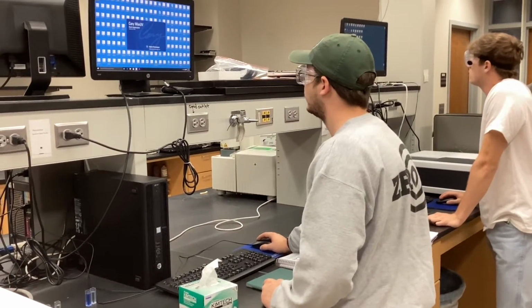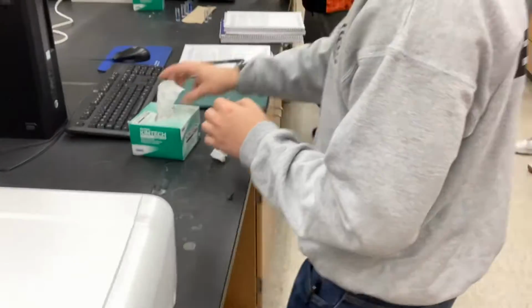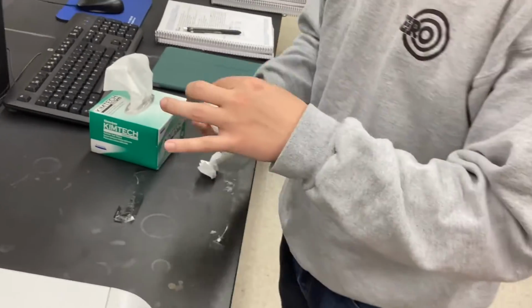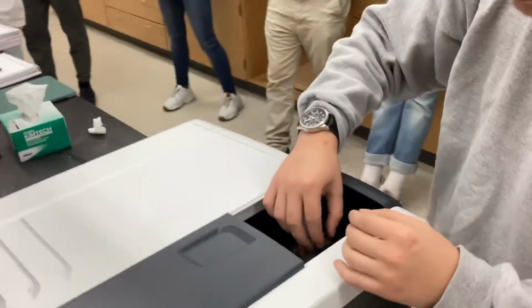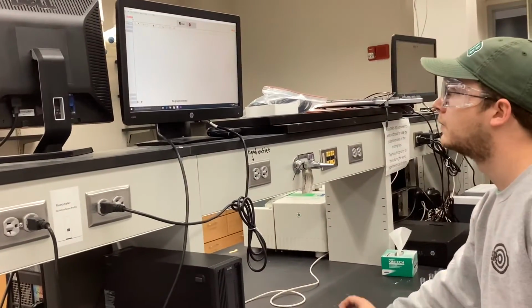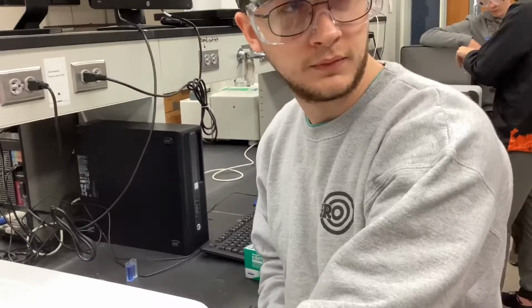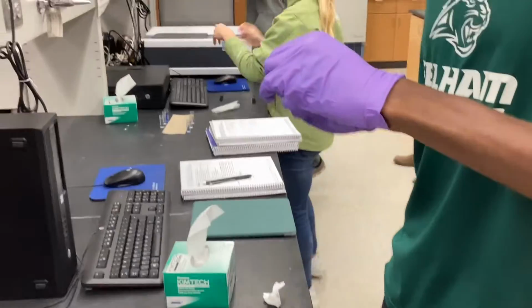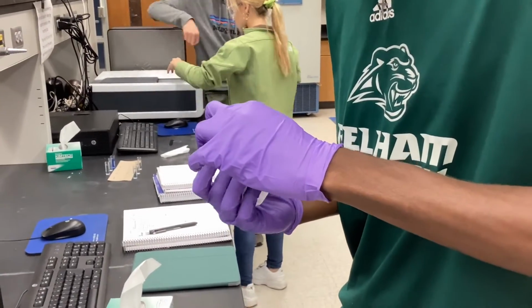First, we open the program Scan. Now it's time to insert the blank. We are going to be wiping down two sides of the cuvette and then placing those two sides towards the beam. Now we are zeroing it on the computer. Now it is time to clean and insert dilution 1.